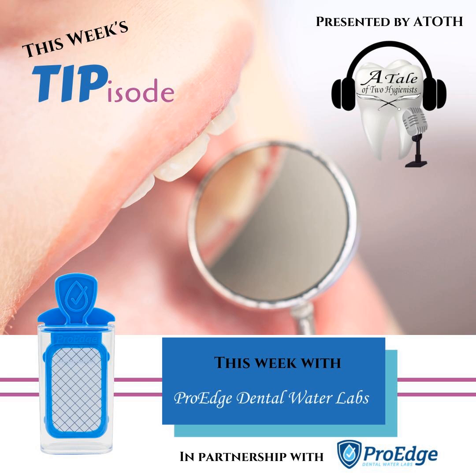So combining samples, commingled or pooled samples from the same operatory, is a great way to save 50 to 75% right off the top. How do you do it? Well, instead of buying a water test for every single line in your office, which can get expensive, just get one for every operatory or every dental unit, and then take a combined sample.